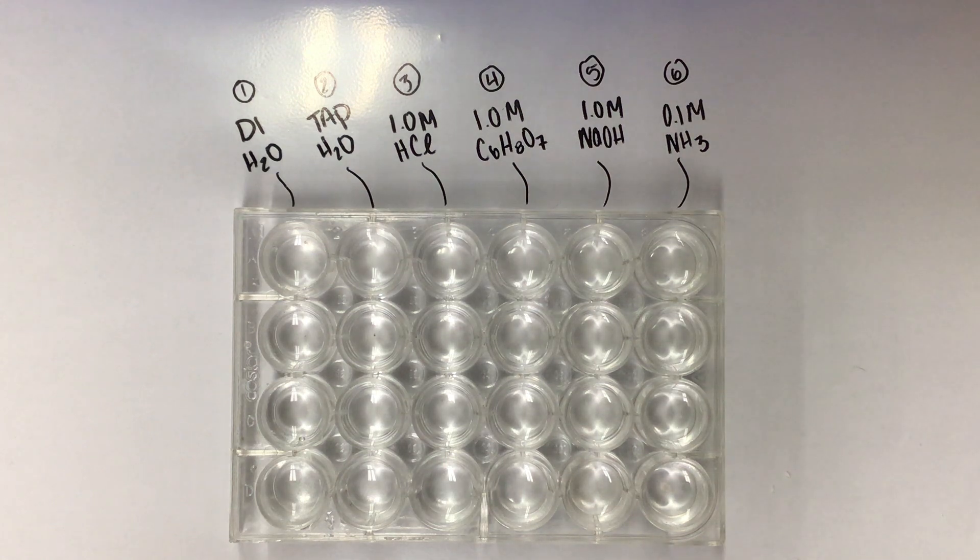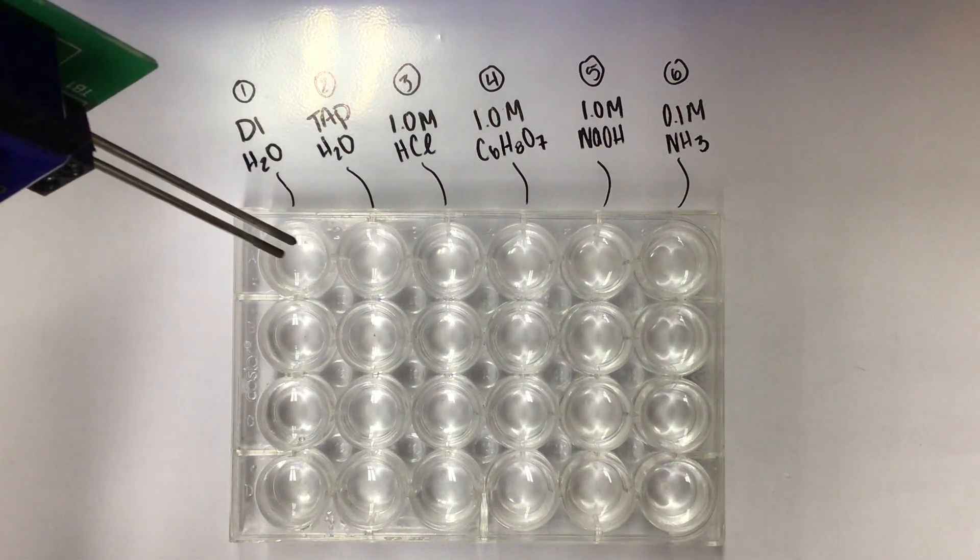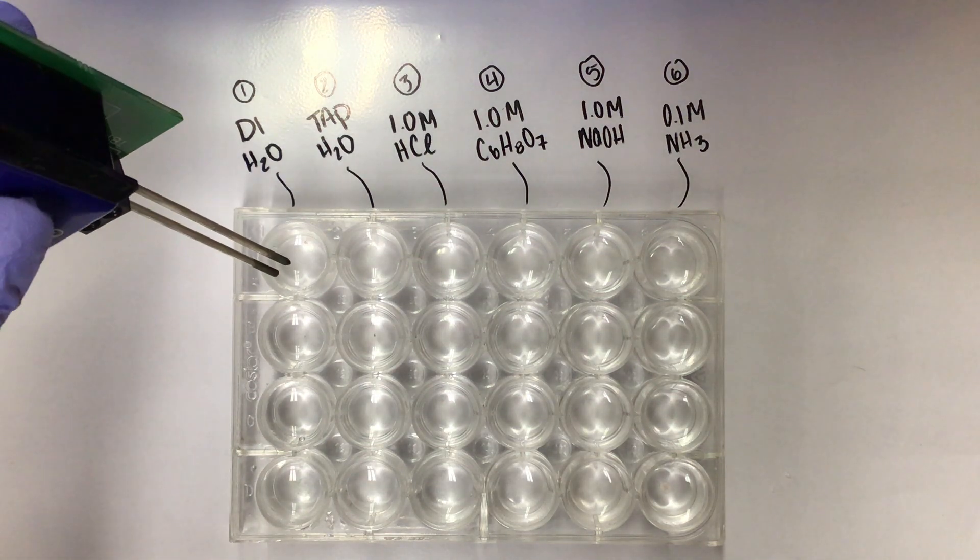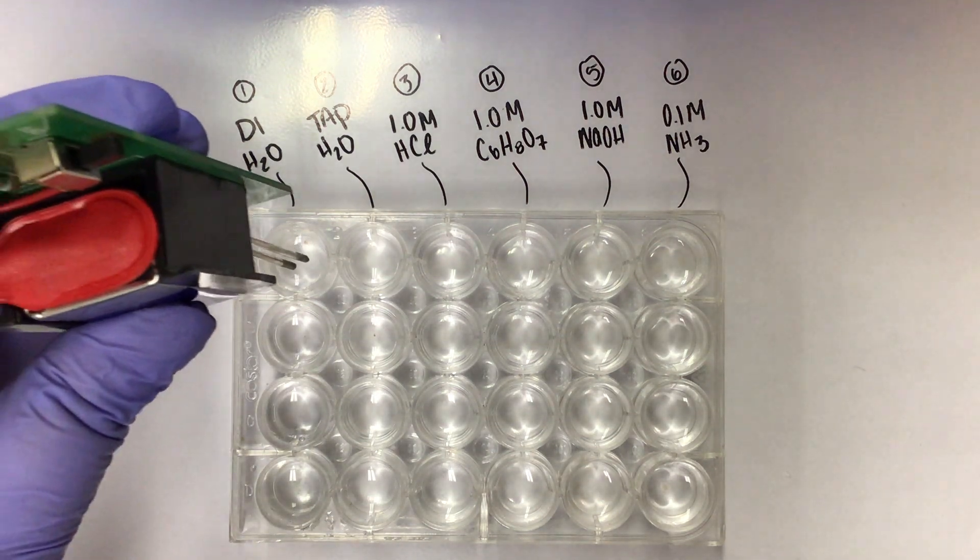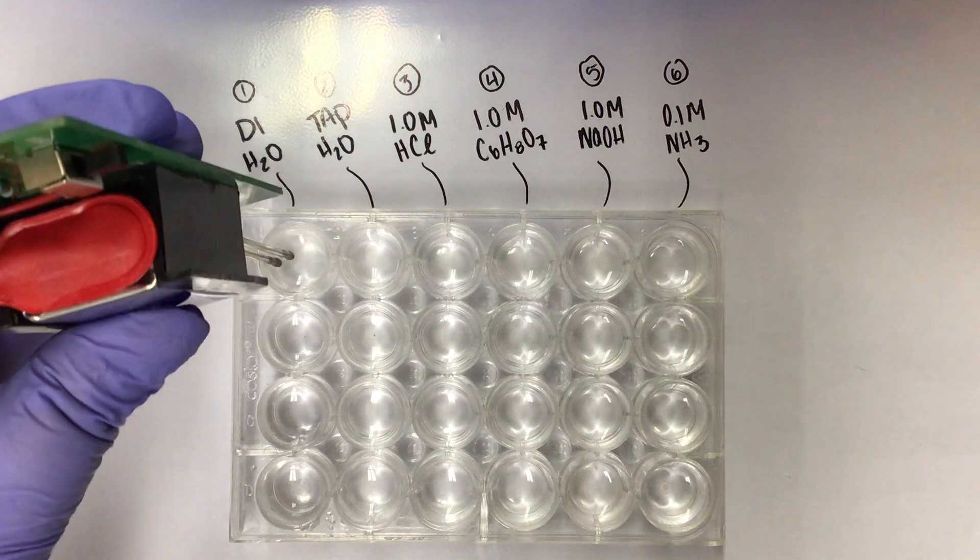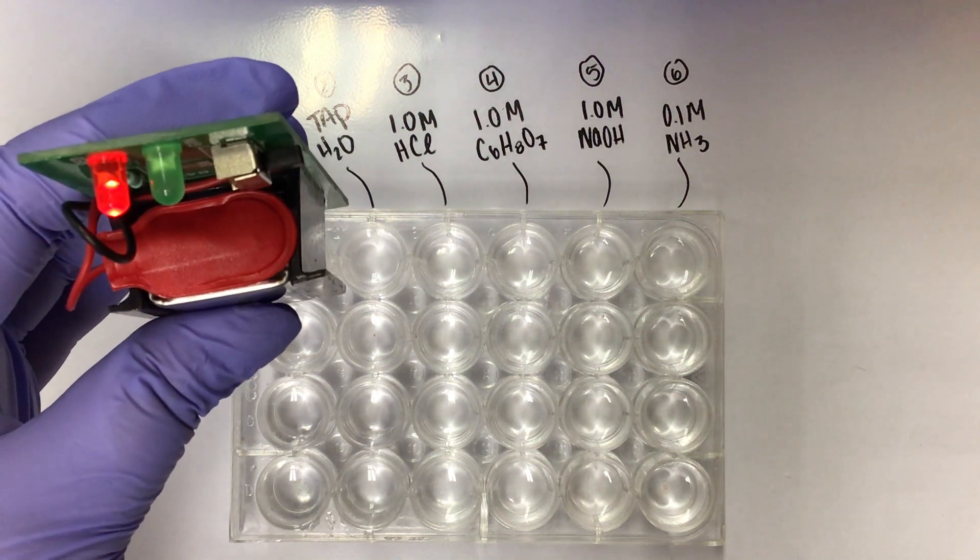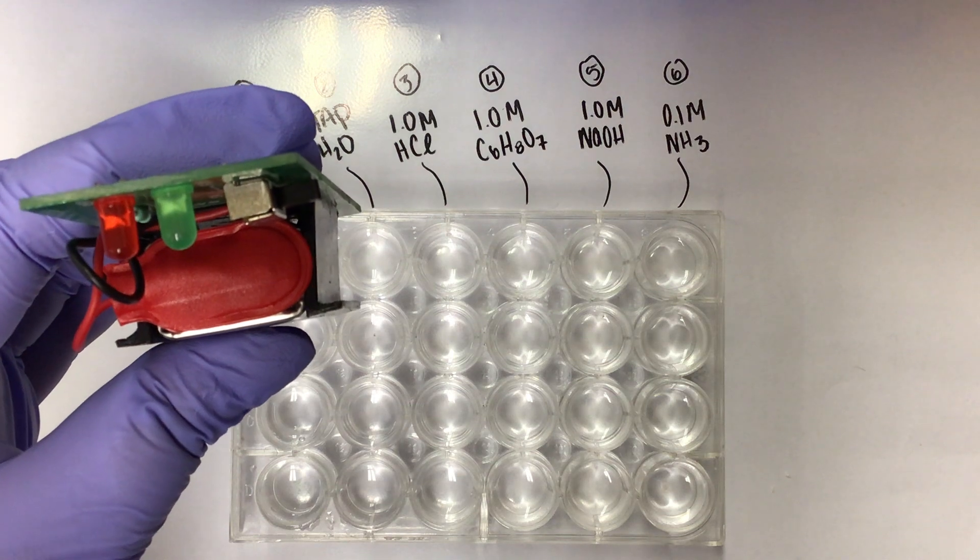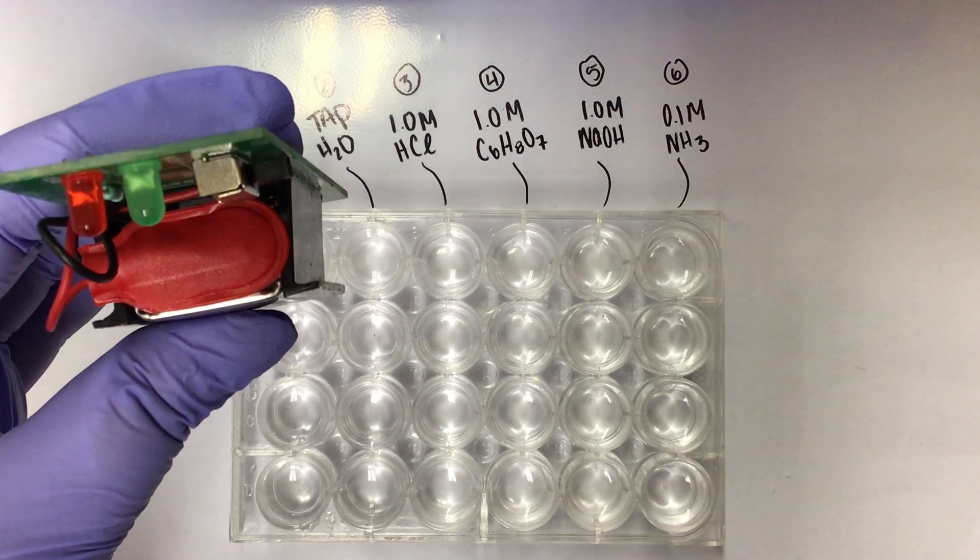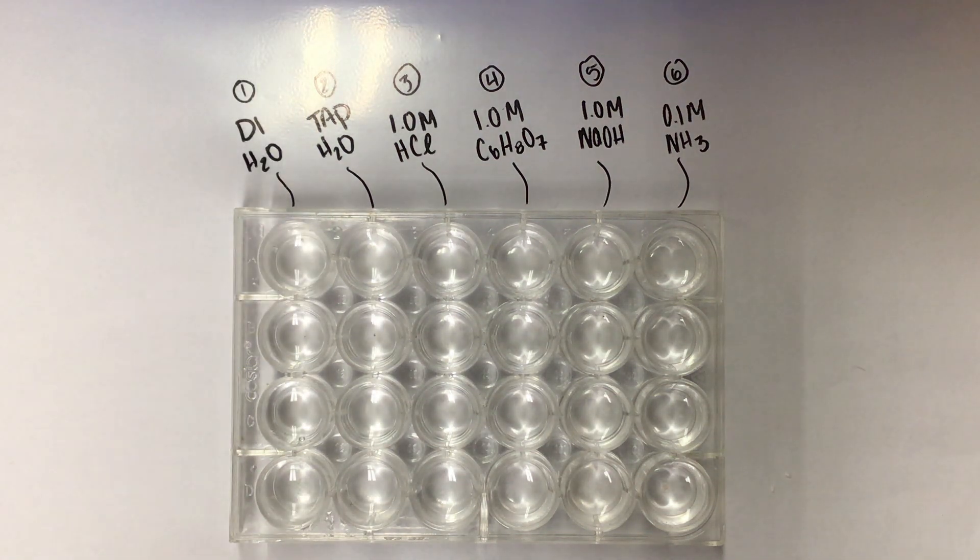Our very first test is for conductivity. I'm going to start in well one here and place the probes inside each of these, rinsing with water in between. If I put this into the DI water, the lights are not lighting up at all. This means it is not conductive.